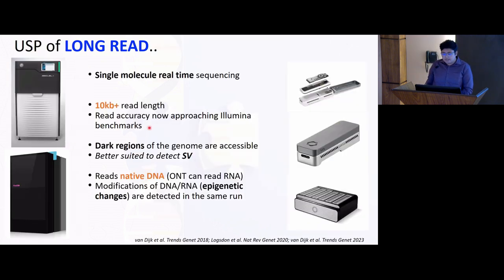So just before that, what are the common things here? Both of them are single molecule real-time sequencing, although the PacBio technology is known as SMRT. They routinely can produce 10 kb plus read lengths. The read accuracy has now started to approach Illumina benchmarks. This is very important. We will discuss it.